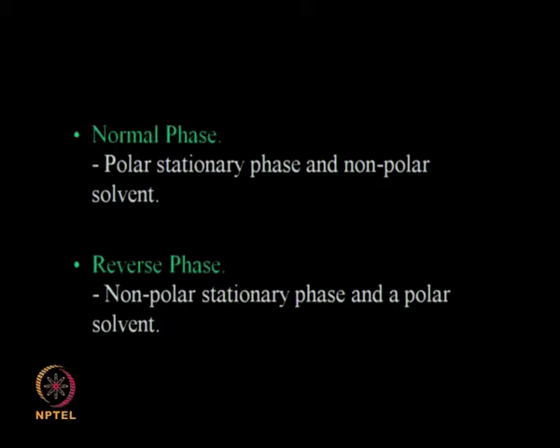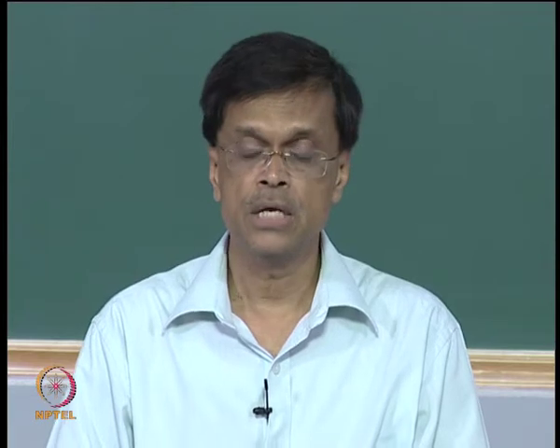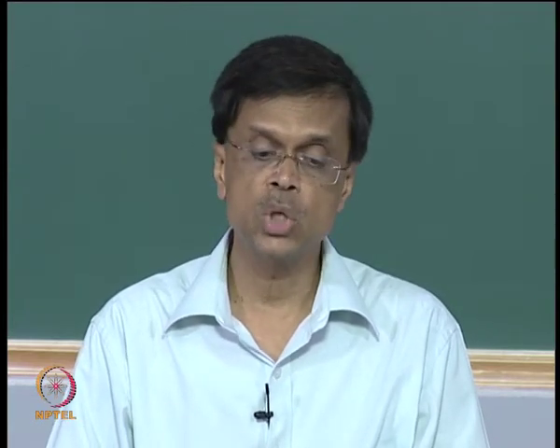So nowadays the fashion is to go towards reverse phase because the solvent which you are using is extremely cheap. Mostly you will be using water, predominantly water, and it could be some other organic polar compound. In HPLC we consume quite a lot of solvent, both for analytical purposes as well as for regeneration, cleaning, flushing and so on. So reverse phase HPLC has become extremely popular.